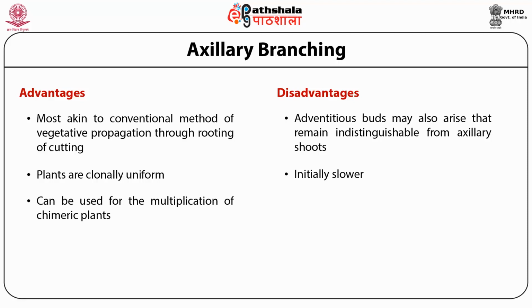It's the most reliable method in terms of genetic uniformity of the micropropagated plants, and thus the most favored method for in vitro clonal propagation of plants, but it cannot be applied to all species.